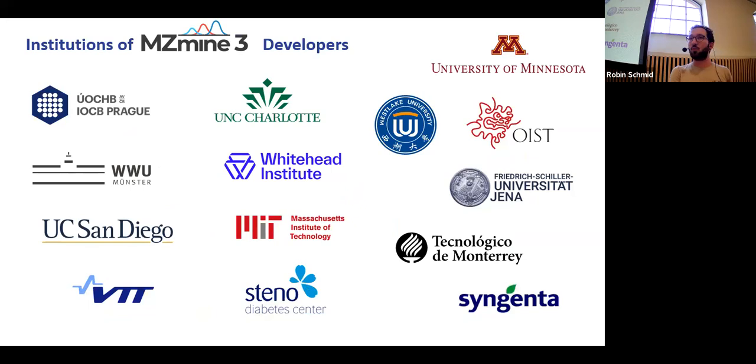So it's not just one person who started a project. Tomasz always kept it very open, so people could just come in and add a new module that might just be interesting to you or maybe your lab. We were very open to just say, if it doesn't break anything else, why should we not host it in MZmine?